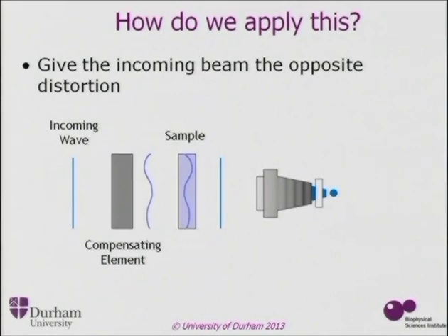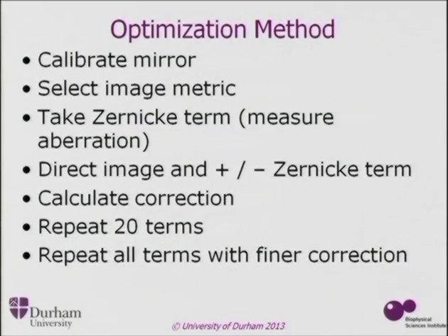So in other words, what we're doing is putting on the opposite shape. We can do exactly the same thing. We've done it in our SPIM microscope, where we don't alter the light coming in, we just look at the light coming back out because we know it's being distorted. So we can apply the opposite shape on our optical element to correct for the aberrations that are present. The way that we do this, for people who are interested, we have a mirror.